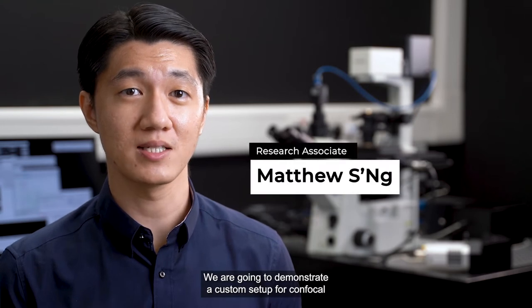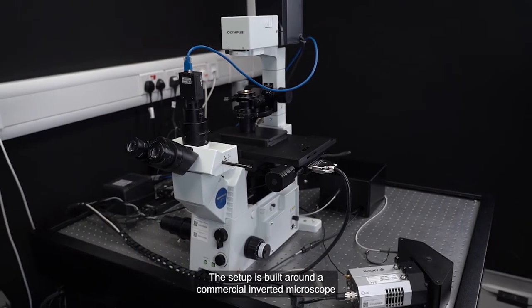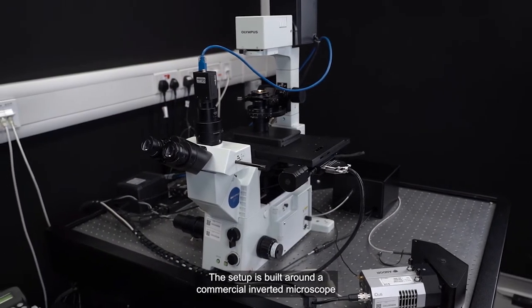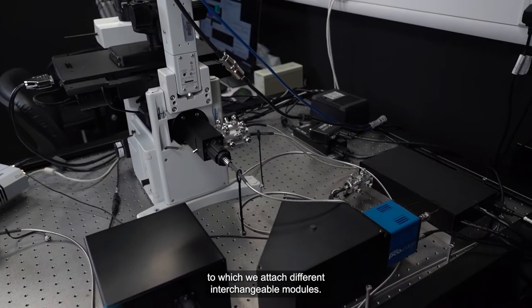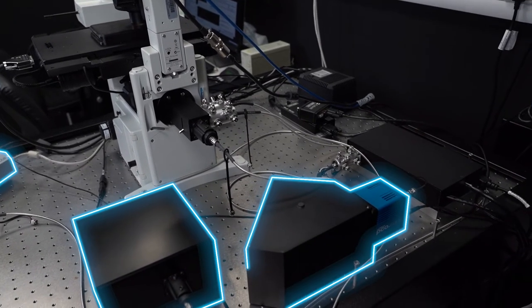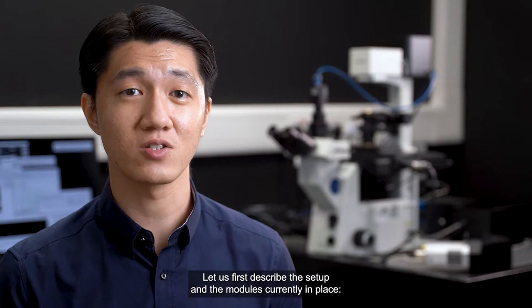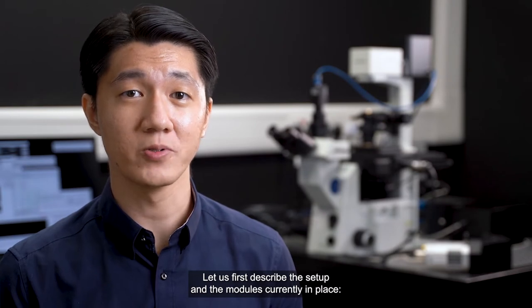We are going to demonstrate a custom setup for confocal microspectroscopy of Raman and Brillouin scattering. The setup is built around a commercial inverted microscope to which we attach different interchangeable modules. Let us first describe the setup and the modules currently in place.